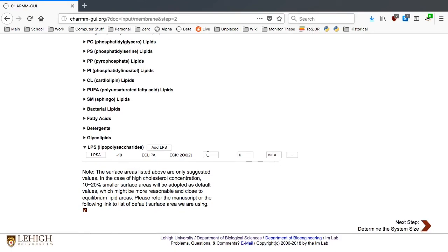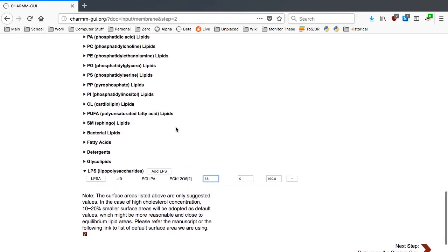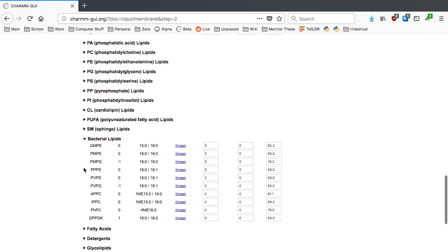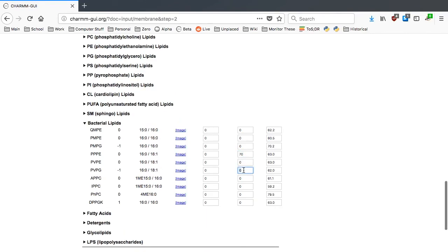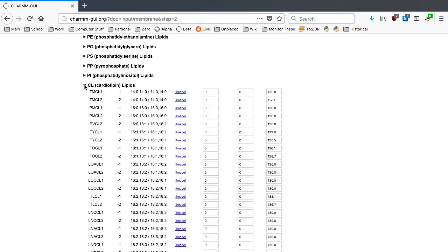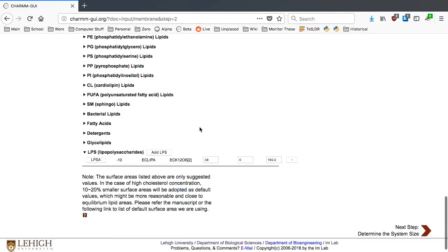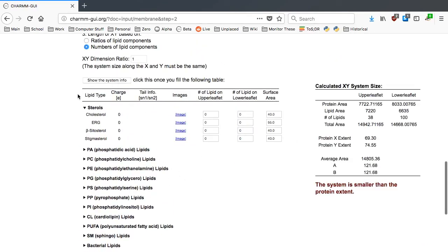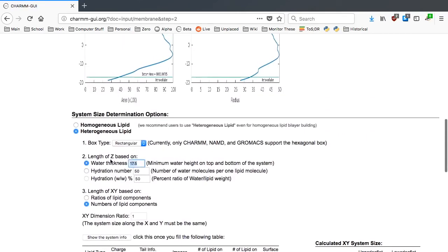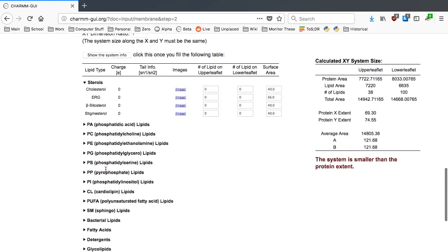In this tutorial, we will add 38 E. coli LPS in the upper leaflet. In the lower leaflet, we will add 75 PPPE, 20 PVPG, and 5 PVCL2. Once you are done with that, click the Show System Info button. Change the water thickness to 30 angstroms and proceed to the next step.